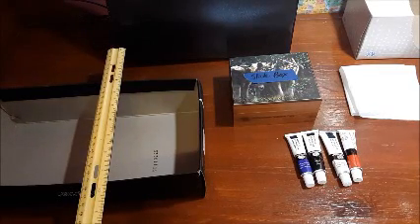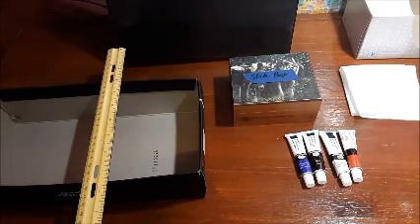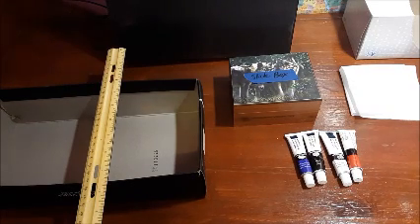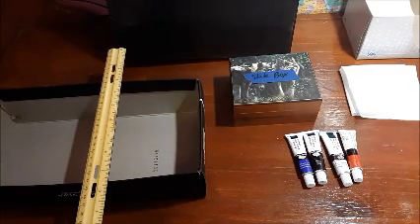Okay, so like I said earlier, now that your smear has been prepared, you are now ready to start the staining procedure. The first stain that you will be doing is the gram stain. Now this stain enables the user to examine the bacteria and determine whether bacterium in the sample is gram positive or gram negative.